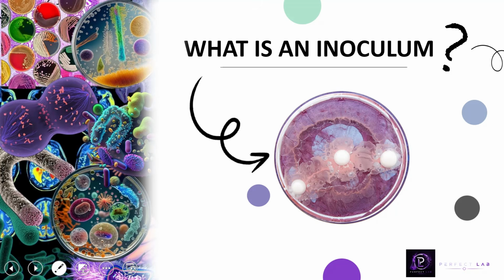Have you ever wondered how microbiologists grow microorganisms in the laboratory? It all begins with something called an inoculum. In today's video, we will learn what an inoculum is, why it is important in microbiology, and how it is used to start microbial growth in culture media. And I believe by the end of this lesson, you will understand the role of an inoculum and the basic steps involved in inoculating culture media using an inoculating loop.